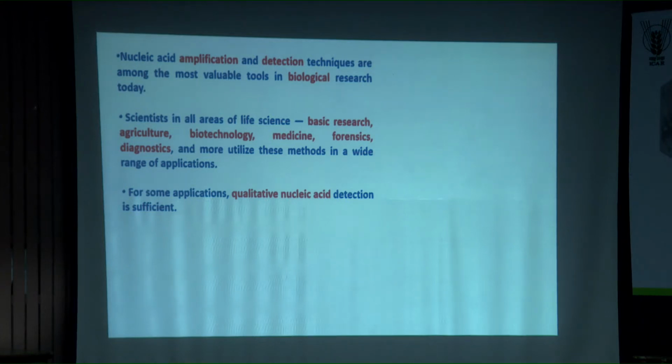If you talk about classical PCR, normally you wait for a couple of hours and maybe another couple of hours to know whether the technique worked or not, right? At the time of setting up the PCR, maybe you set up in 25 microliter or 50 microliter. After 2 or 3 hours of subjecting the cocktail to different temperature regimes, again, it looks the same. There is no difference.